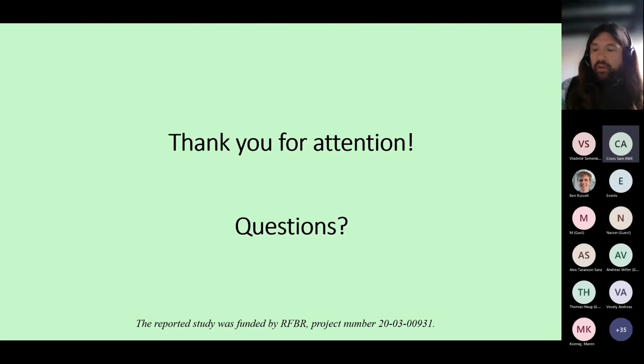So in terms of radiation stability, that's pretty good news. Very nice experiment. Yeah, interesting data. Very good resin, actually. It's really robust, especially for lead. The lead retention is indeed very high. I think the fact that it contains so much octanol is certainly helping in terms of radiation stability.